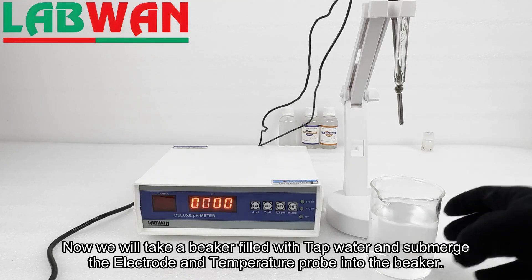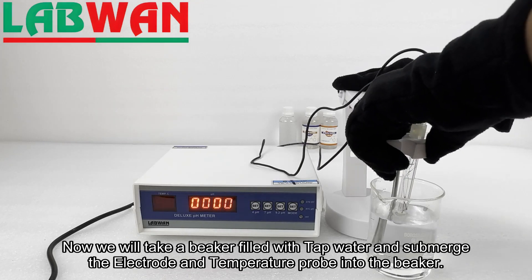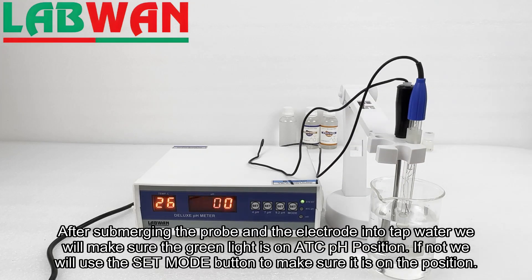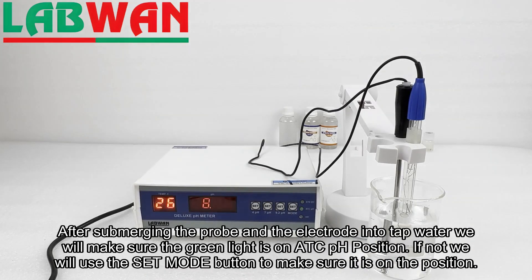Now we will take a beaker filled with tap water and submerge the electrode and temperature probe into the beaker. After submerging them, we will make sure the green light is on the ATC pH position. If not, we will use the mode button to make sure it is on the correct position.